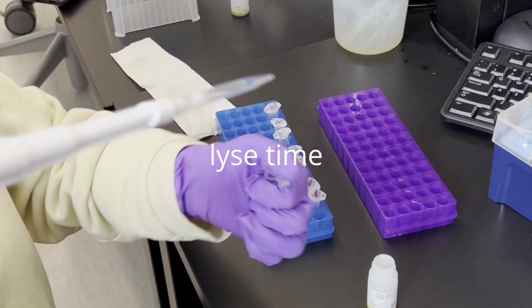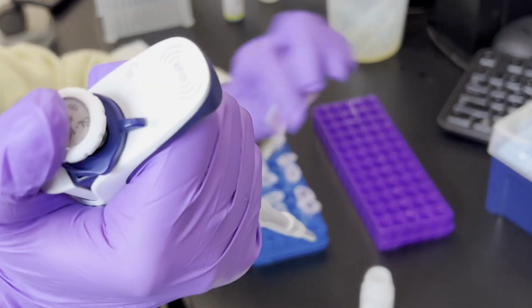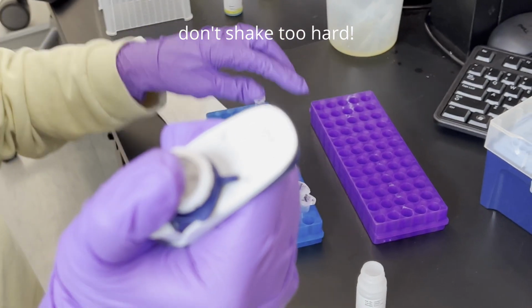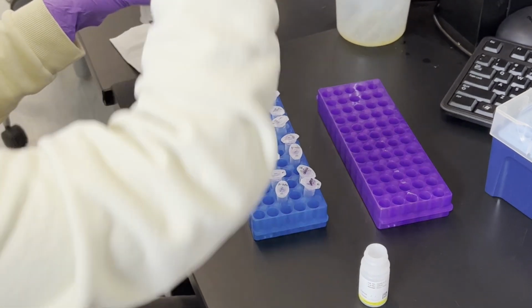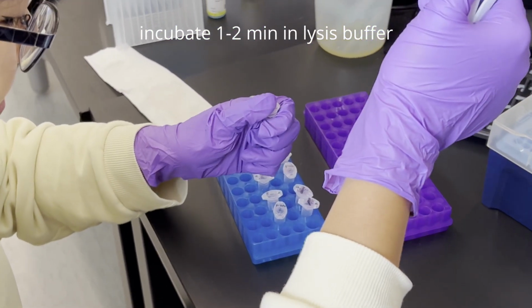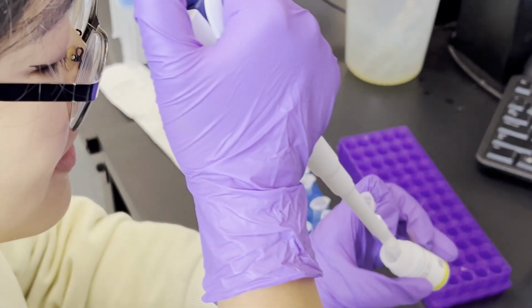Now we will open the cells with lysis buffer. For the next two steps, we have to be careful. If we shake too hard, we will destroy the plasmid DNA or open the nucleus, which causes our sample of plasmid DNA to be contaminated with genomic DNA. We often have to incubate for 1 to 2 minutes at this step, but don't let lysis continue for too long. We might destroy the plasmid DNA, and this can also cause genomic DNA contamination.